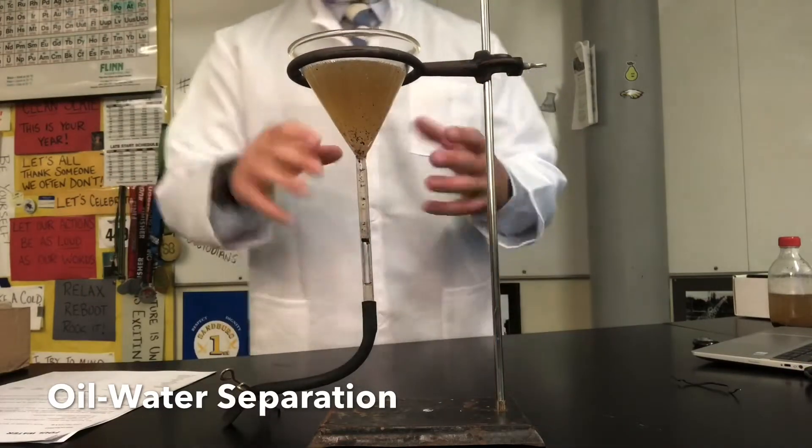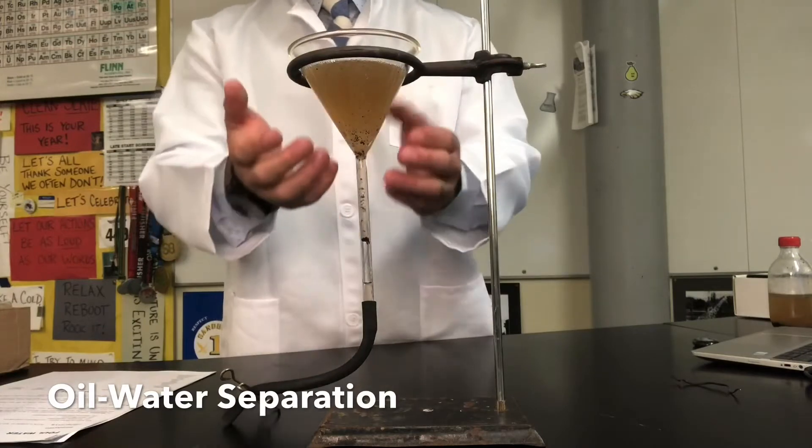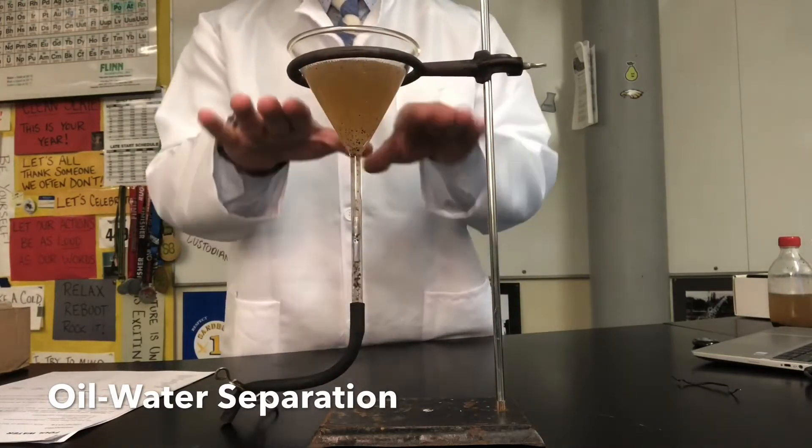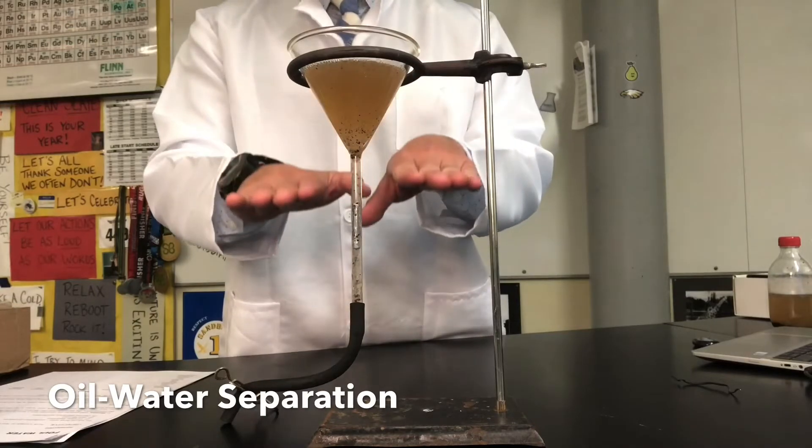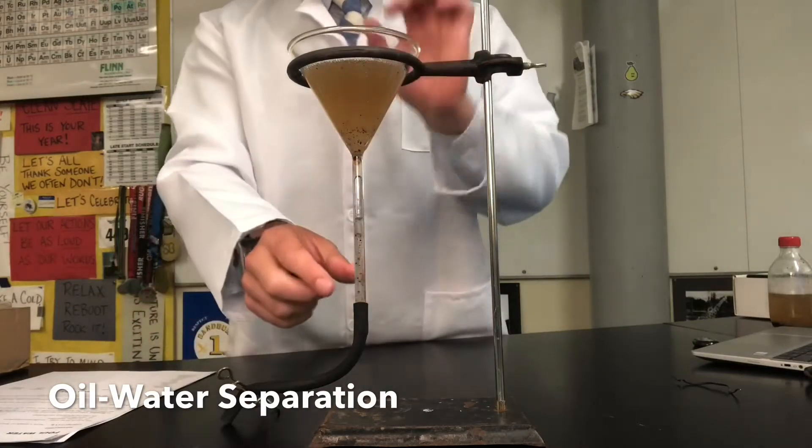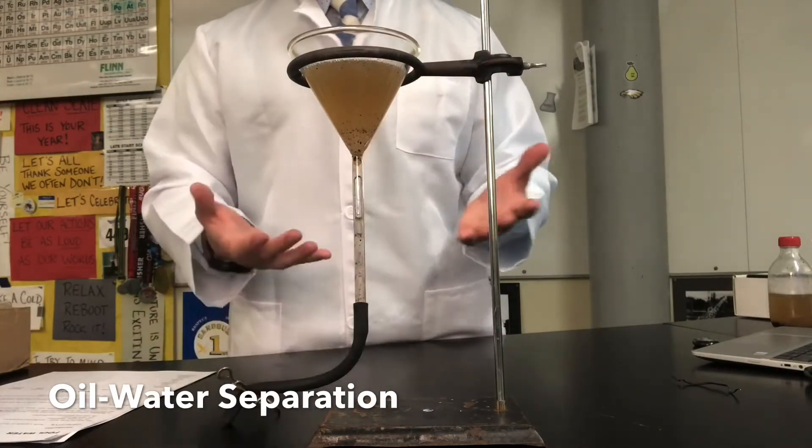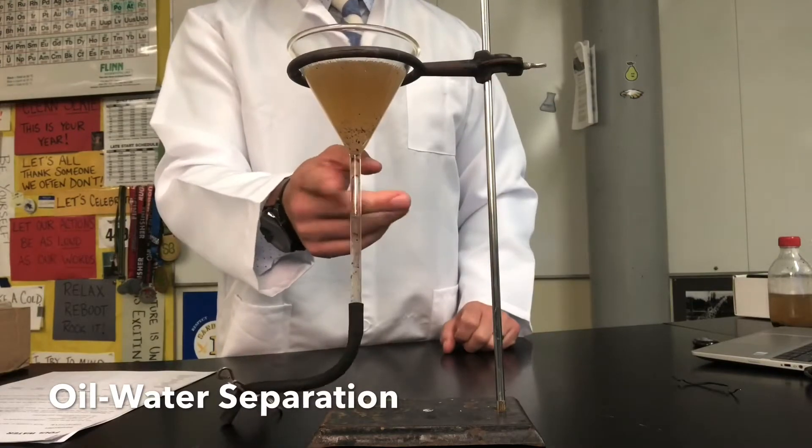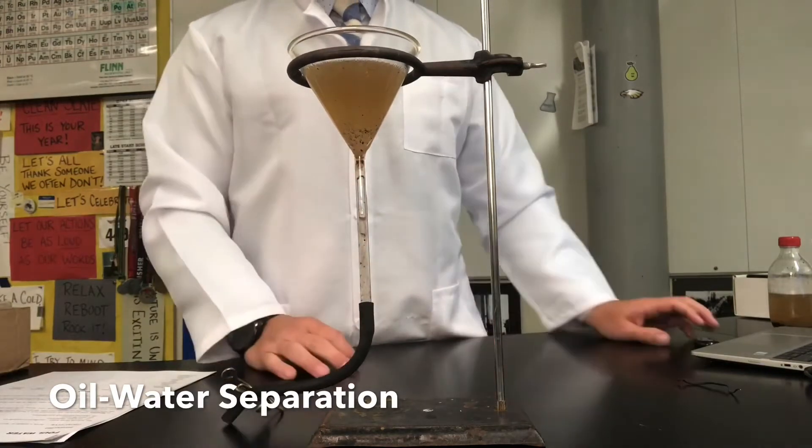So what I'm going to be doing is taking advantage of the difference of their densities so that eventually I can get all the oil to the top and physically separate the water towards the bottom. I'll then be able to let out the water from the bottom and keep the oil behind. That's the goal. So we're going to give this a few minutes to set up and sit so we can try to separate these as best as possible.